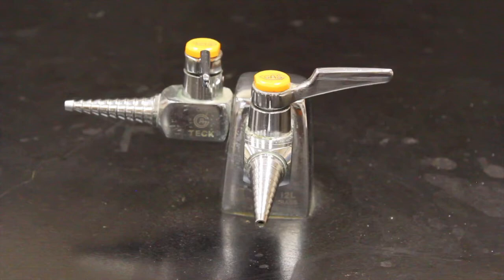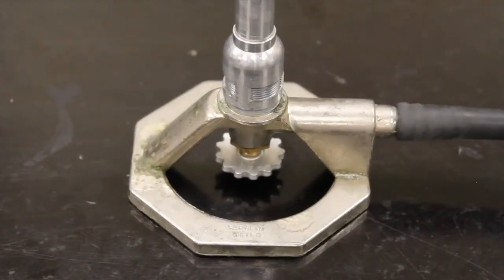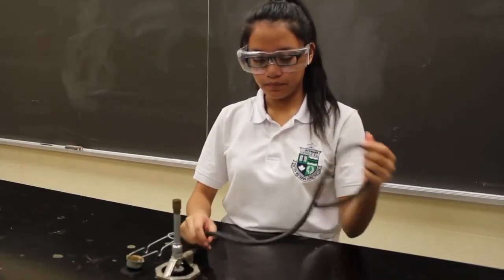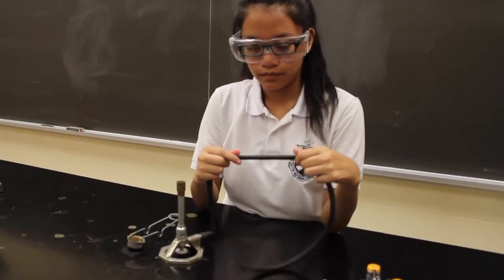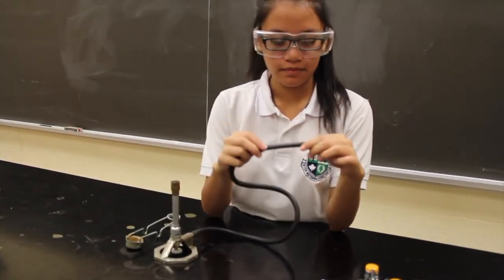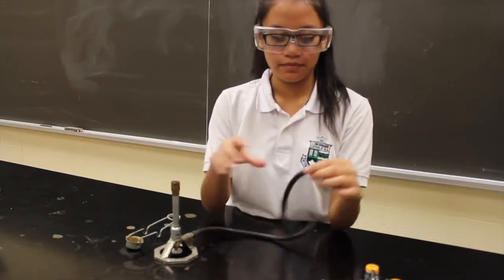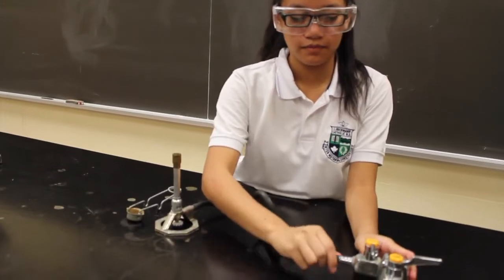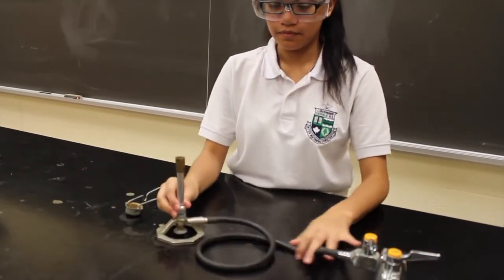An outlet on the bench provides the gas for the Bunsen burner. A rubber hose is connected to the tip of the outlet and to a similar tip on the Bunsen burner. It is important when connecting to the Bunsen burner to always check for cracks in the hose. The flow of gas is controlled by a valve usually found on the bottom of the Bunsen burner. The amount of oxygen in the flame is controlled by air inlets. When using a Bunsen burner, be sure to secure the hose to both the gas valve and the Bunsen burner.